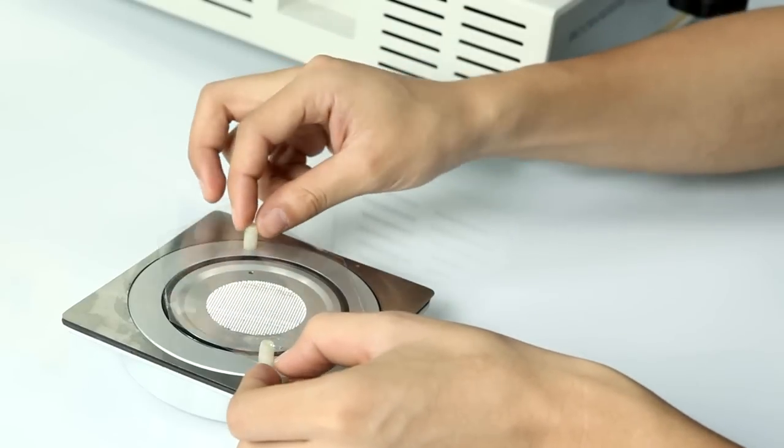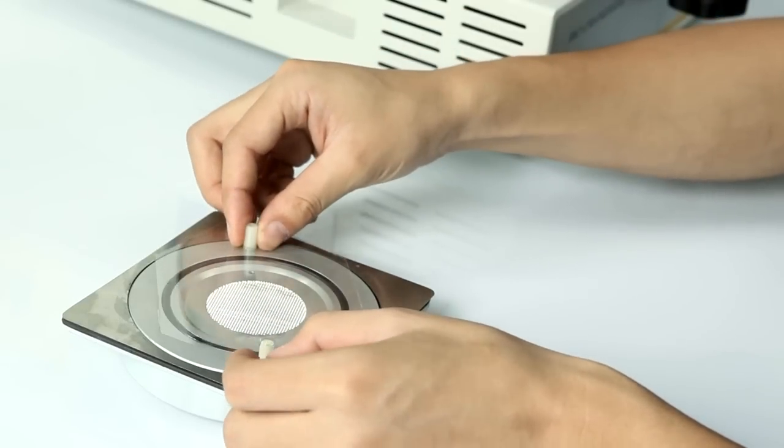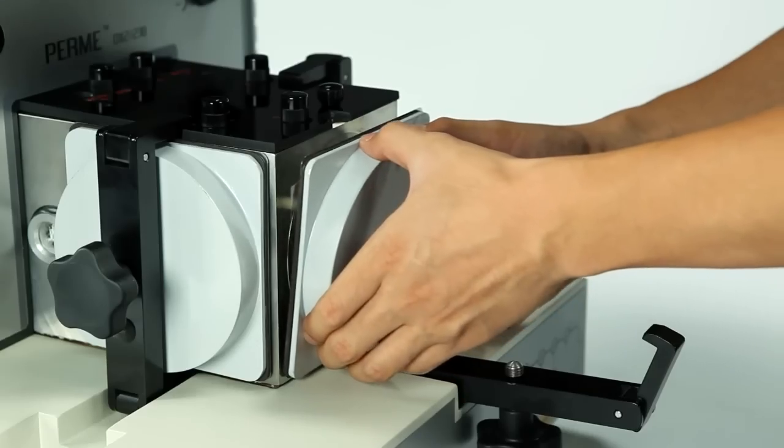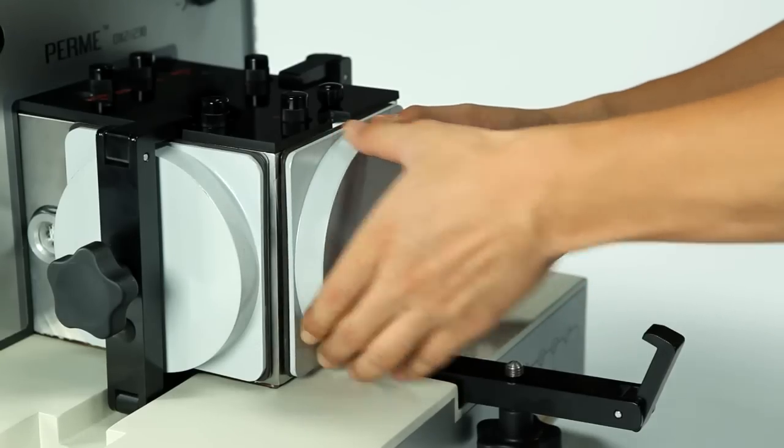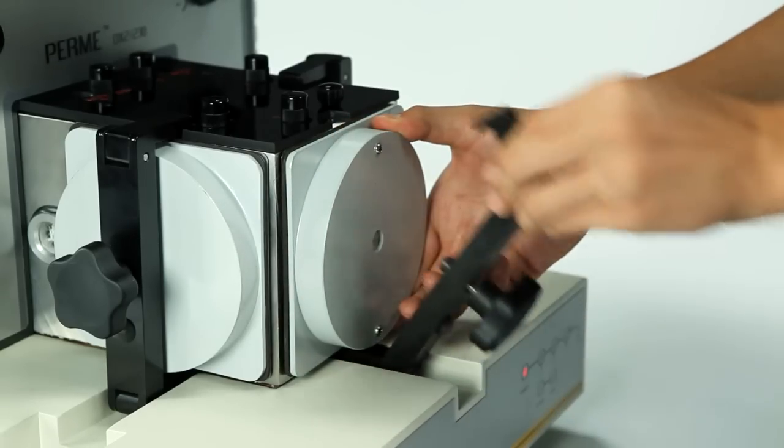The whole system can be easily and quickly calibrated by the standard films provided.